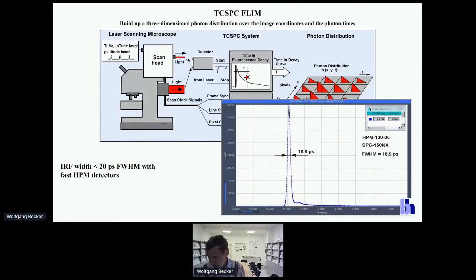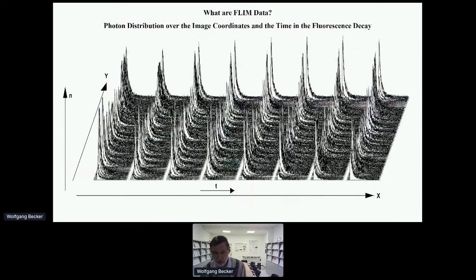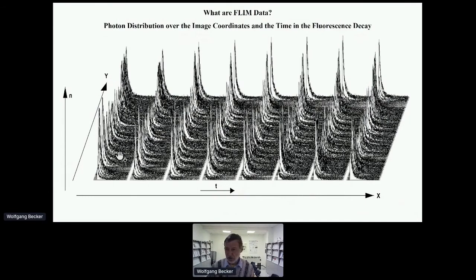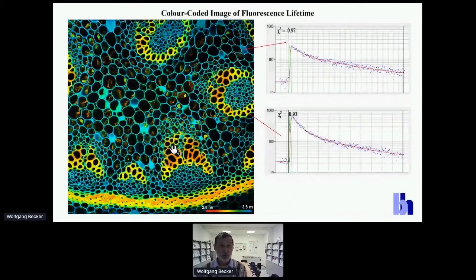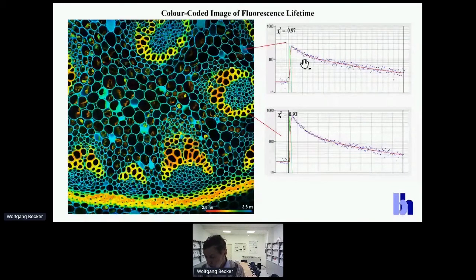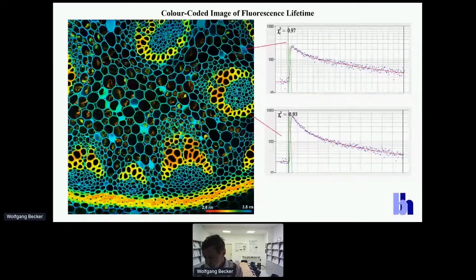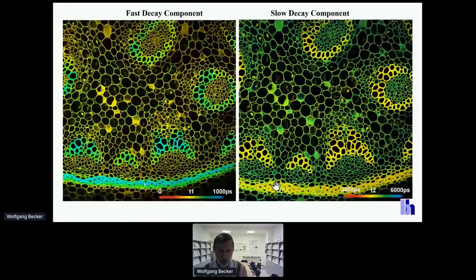How does our data look? This is a photon distribution recorded by TCSPC FLIM. It may look complex, but all these individual peaks represent a fluorescence decay in one of the pixels of the image. The task of data analysis is not just to convert this into a lifetime image — you can extract images of the lifetimes and amplitudes of the decay components. This is the real information behind these data.